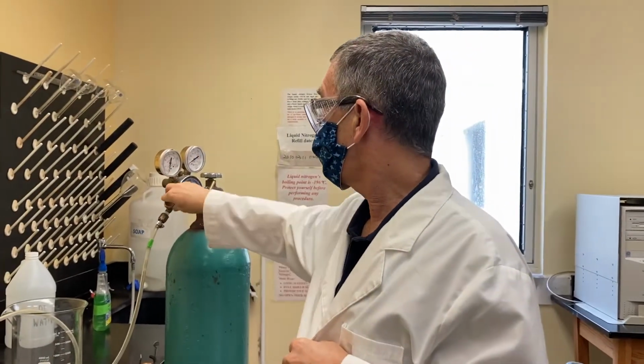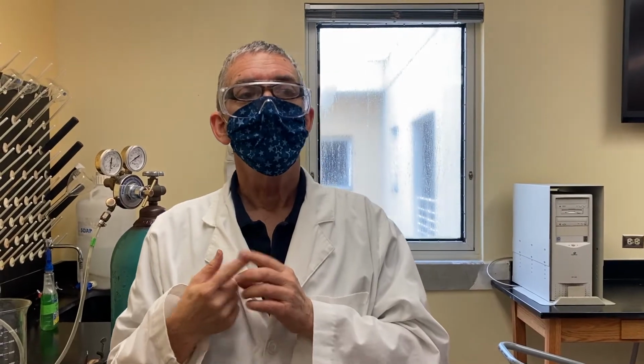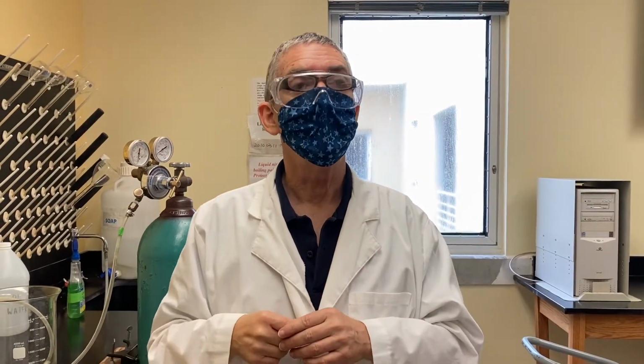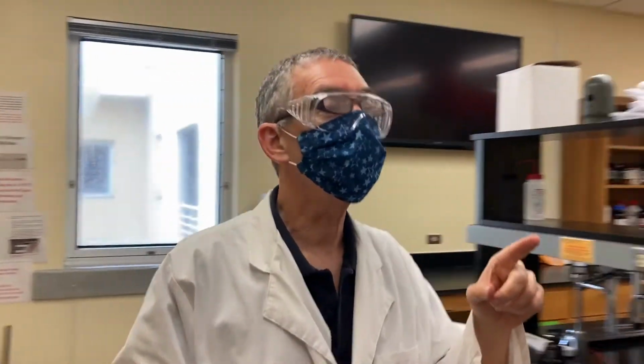The first thing you should do before you start your experiment is measure the atmospheric pressure with the barometer. There will be a separate video. It'll be really at the end of this video. It's all going to be one thing, but we downloaded it. So I won't show you how to read the barometer, but I want to show you where it is. So we're going to walk over to the barometer.